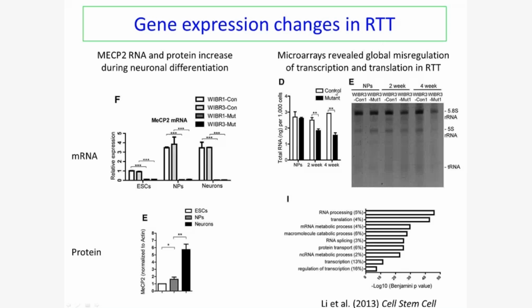This, along with the fact that mutant cells are known to be smaller, as I'll show you in a subsequent slide as well, meant that precise analyses of global gene expression required very specific controls, which are elaborated upon in this study, but they include, for example, specific RNA spike-ins that allowed more precise analyses.